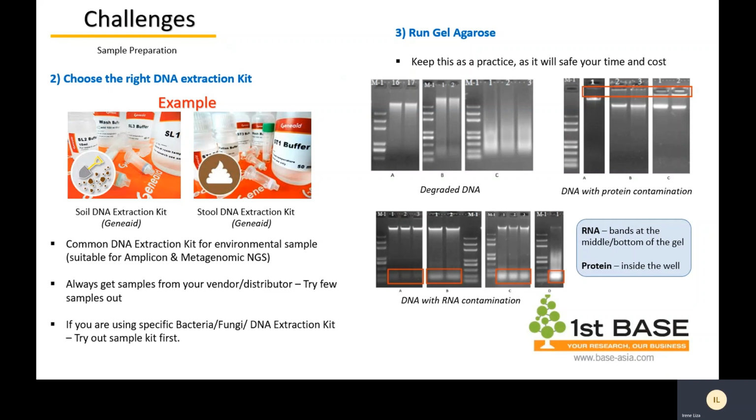All right, so it is good, once you have extracted, to run a gel to verify. Keep this as a practice because it literally saves your time and cost.